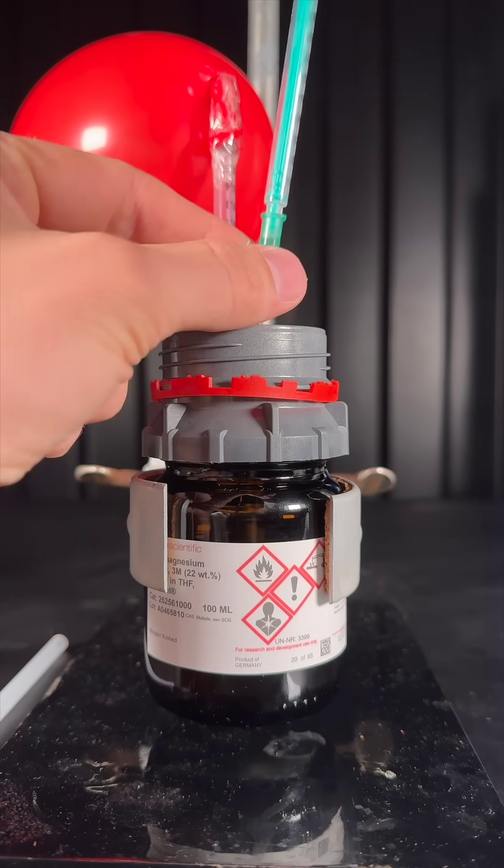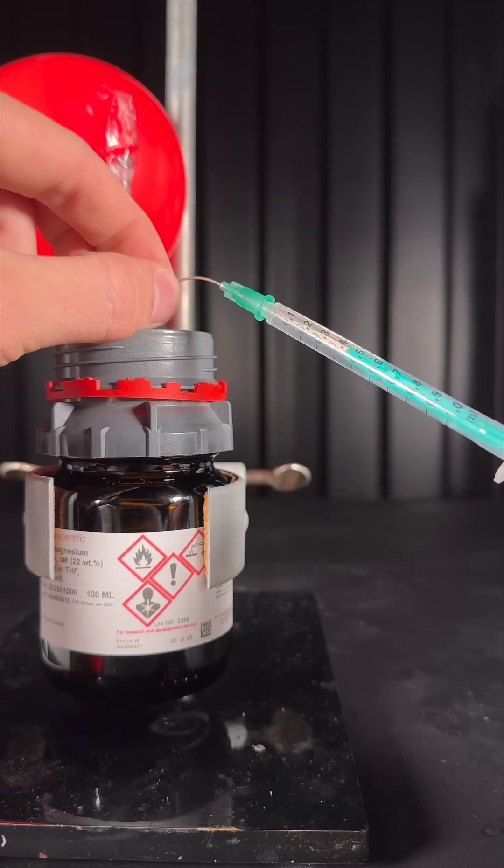I stuck in a syringe, flushed it a couple times with argon, and then sucked in 1 ml of the Grignard reagent.